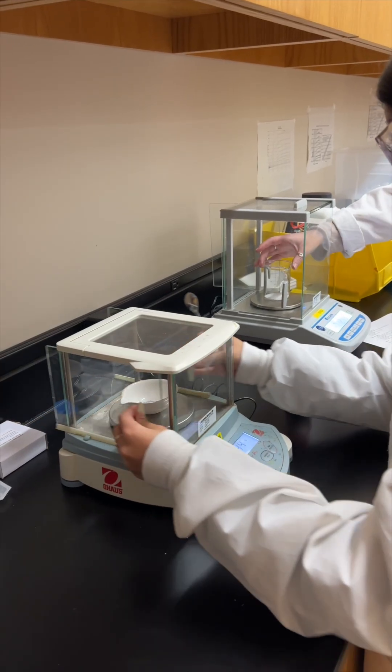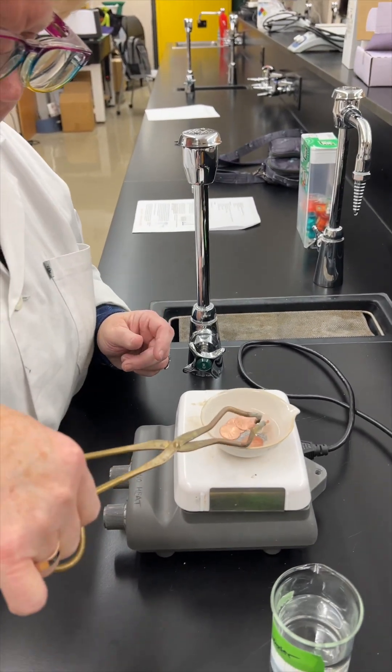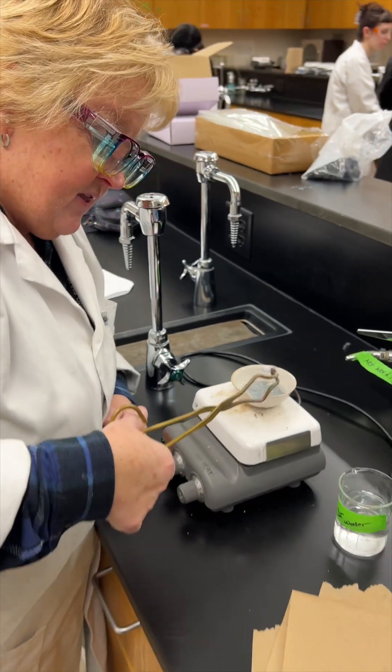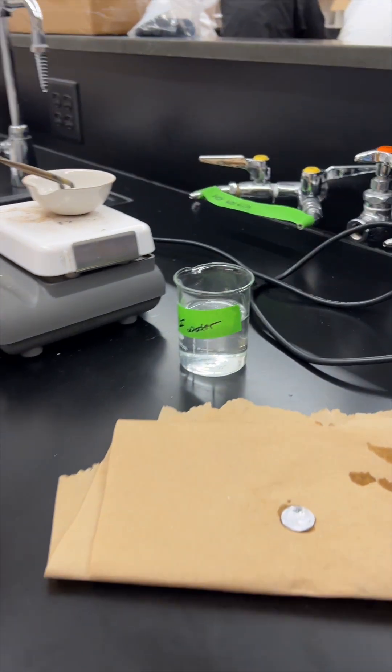You can start to see a silvery color on here. I did it in the right order. Look at this — a really good coating. I'm going to put it in here and rinse it off for each of those pennies.